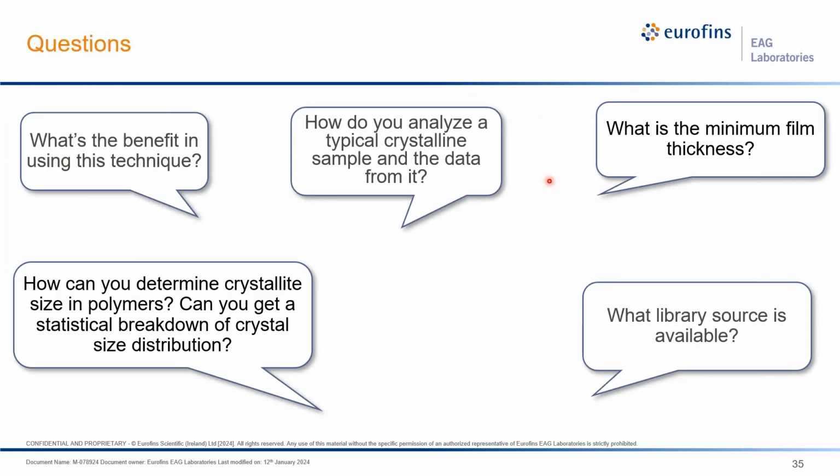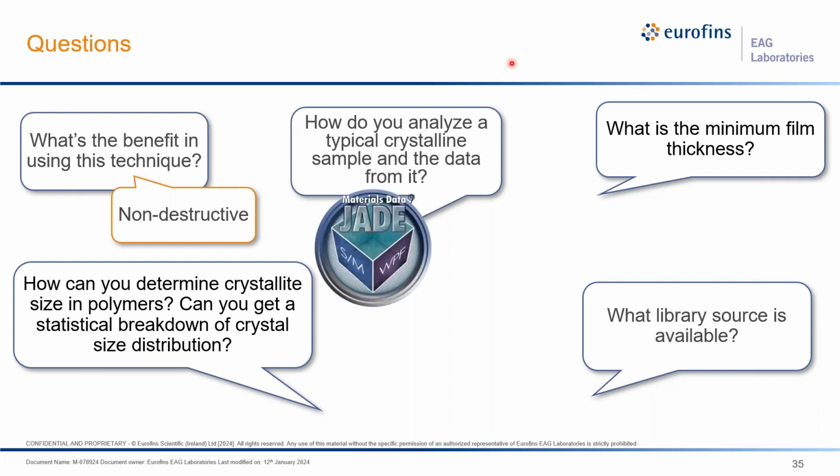And I just have a couple of seed questions here, summarizing some common questions that we get about X-ray diffraction. But a really great benefit of using XRD is that it's typically non-destructive, as long as we don't have to adjust or modify your sample to fit it into the instrument. The X-rays itself are not going to actually damage the material.